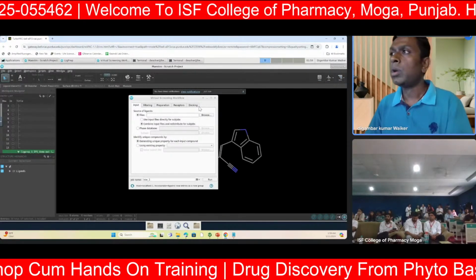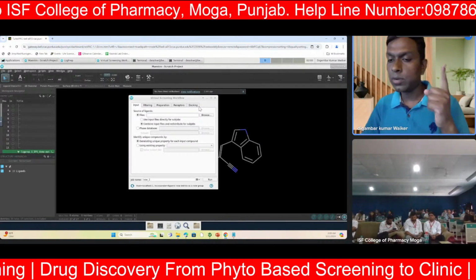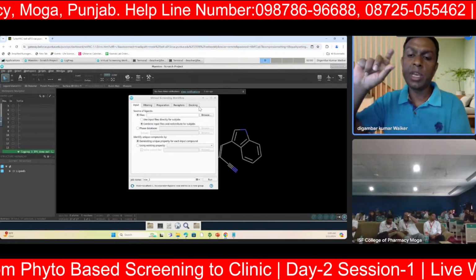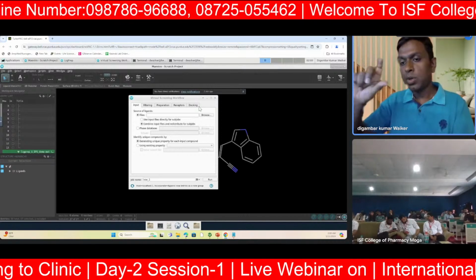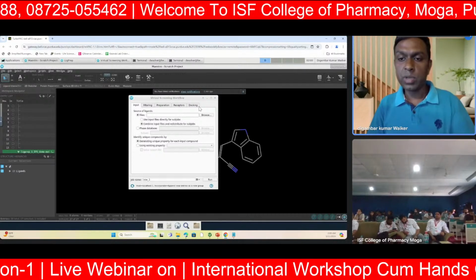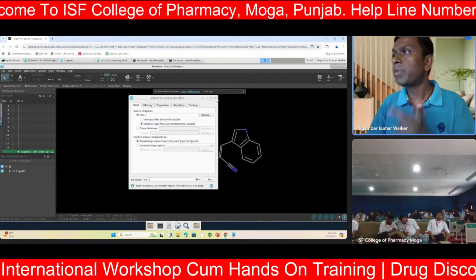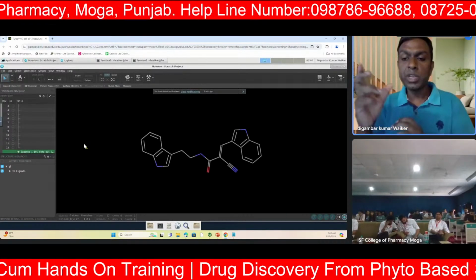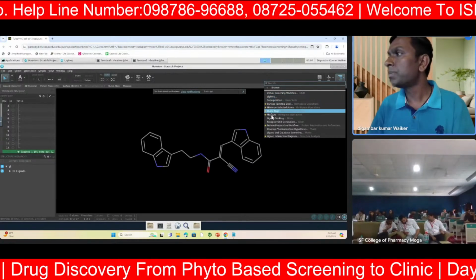workflow. Before I go to this virtual screening workflow, because I'm doing the second part, virtual screening, when we have a known protein structure available, I'm going to do the right-hand side part of that workflow. If you remember, if we do not have any protein structure, we take one path, and on the right-hand side, if we have a protein structure available. Before that we need a protein structure, because this is going to be protein-ligand docking. So I'm going to prepare a protein first.